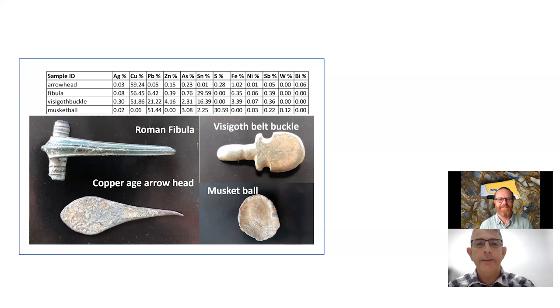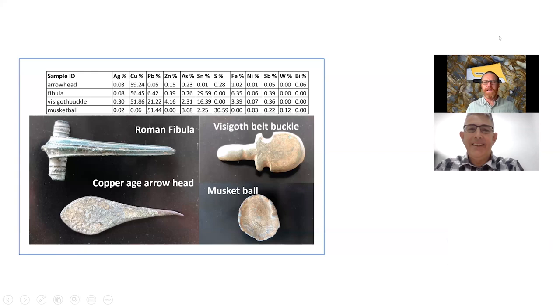So fascinating. I think this is a real nice hobby to have. There are so many universities and museums using Vanta XRF, and very few that are not. I've got a friend of mine who was testing Easter Island statues at the British Museum with University College London. It's so exciting, and I'm glad you put this in because you've talked about the Iberian Pyrite Belt as an empire builder, and then we can really track it through time. I love it.